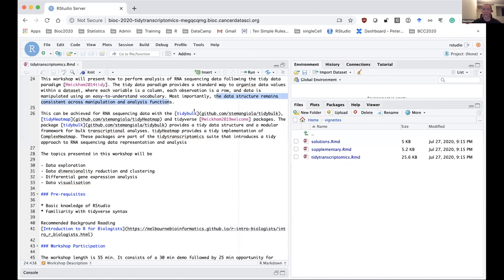The data structure remains consistent with tidyverse standard manipulation and visualization functions. The packages we're going to use in this workshop are new packages created in the last year by Stefano, the co-presenter. The main one we'll be using is the tidybulk package, and we'll also be seeing the tidyHeatmap package. Tidybulk is available in Bioconductor and tidyHeatmap is available in CRAN.